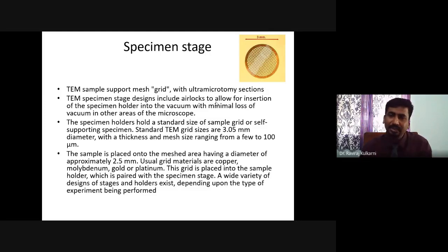How do you do that? We use very high-capacity turbomolecular pumps. Because you are removing the specimen stage and keeping the sample most of the time, that is the reason it should be excluded from the earlier high vacuum. So only this part is taken out, and it is connected separately to an evacuating system, the suction pumps.